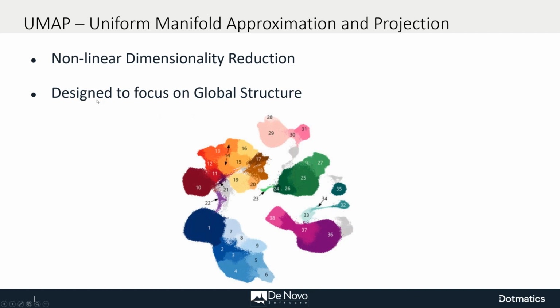So first things first, Andrea had already mentioned this, but it's very important to make sure that you're using well-cleaned, well-scaled data before you start using these algorithms. That's because these algorithms are essentially another step into an analysis, but it's a step abstracted away from the actual single cell data as it's been acquired.